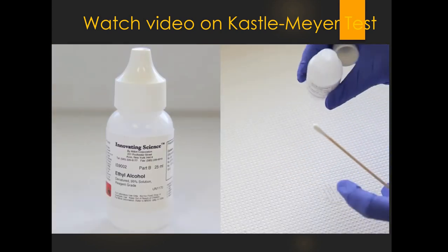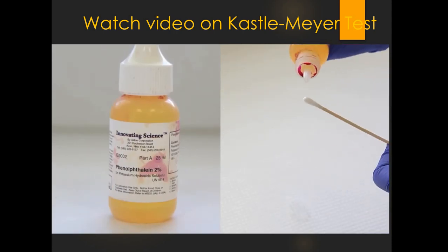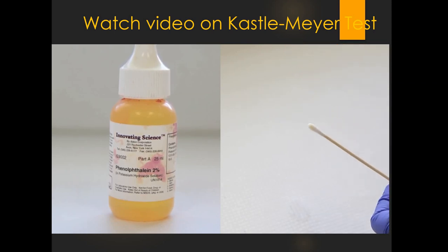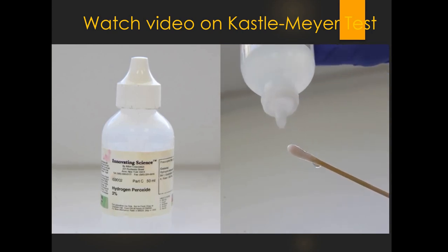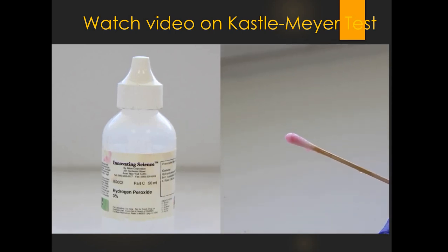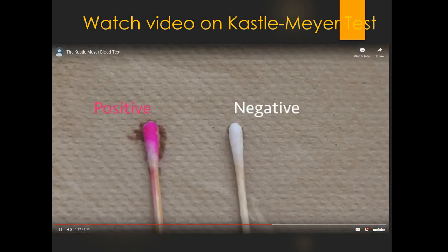Next, add a drop of ethyl alcohol to the swab. After adding the ethyl alcohol, add a drop of phenolphthalein to the swab. Lastly, add a drop of hydrogen peroxide to the swab. Shown here is a positive test result. In a positive test result, the swab will turn pink. Okay, so that's a Kastle-Meyer test. Shown here are positive and negative test results.